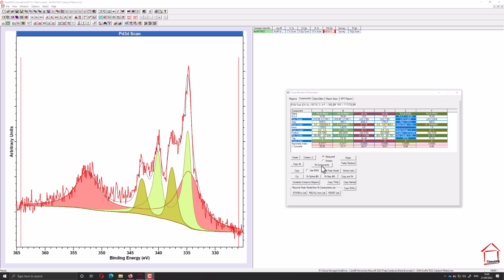So we fitted this spectra already, so we sort of skipped that bit a little bit, so I do apologize, but we can see that we've used the parameters here that we derived from our models previously.